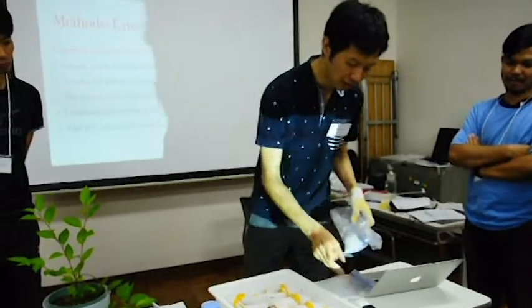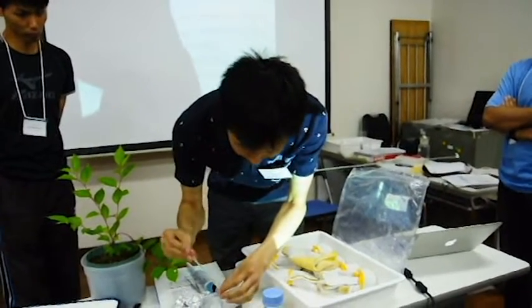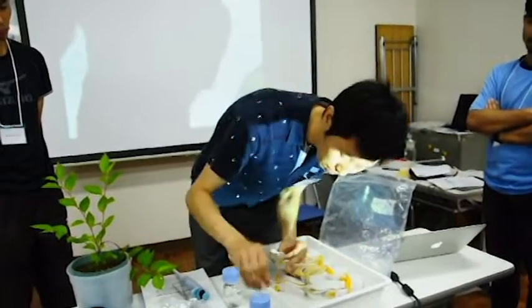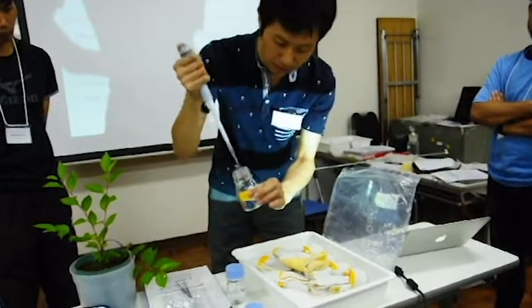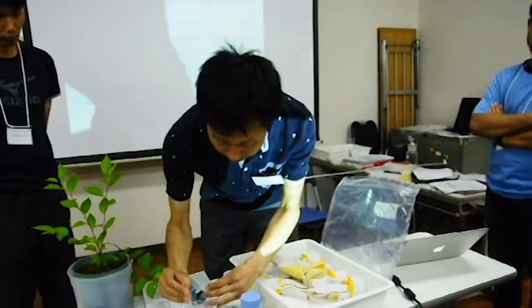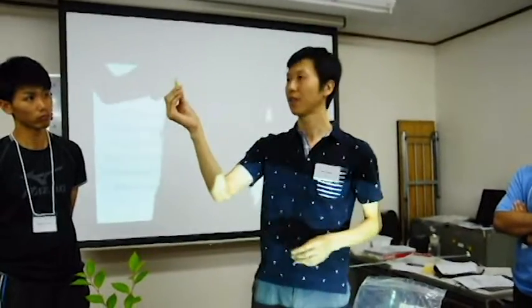Then transfer this solvent to this microtube. These are disposable pipettes. So in order to transfer completely, please pipette, and please repeat again. Add acetone. Transfer. So it's finished. All right.